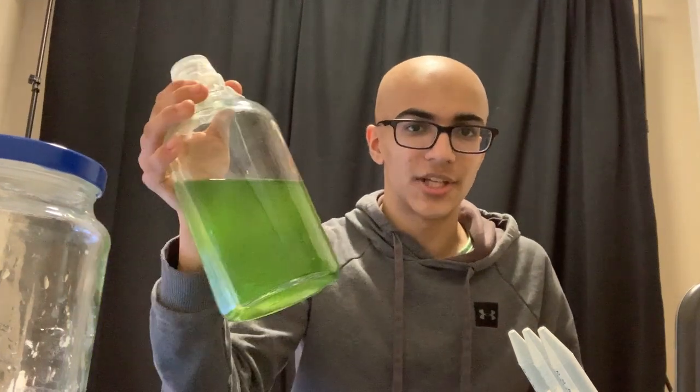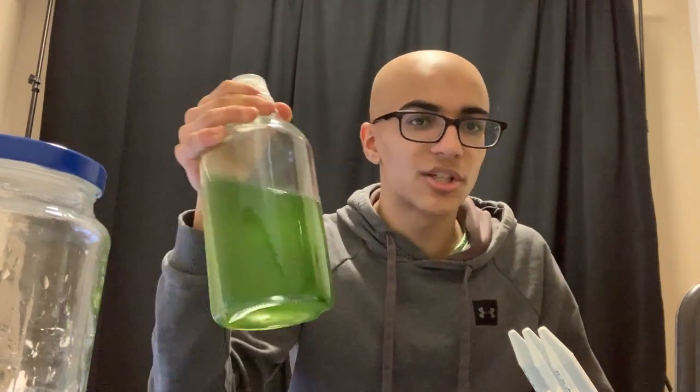the chemicals. And now, after having done all that in the morning, I have brought the bioreactors back down to the basement lab to get the algae in them. But I want to quickly tell you about some of the improvements I've made to the experiment since round 1 from what I've learned. First of all, I'm using much more concentrated algae from my old experiment.